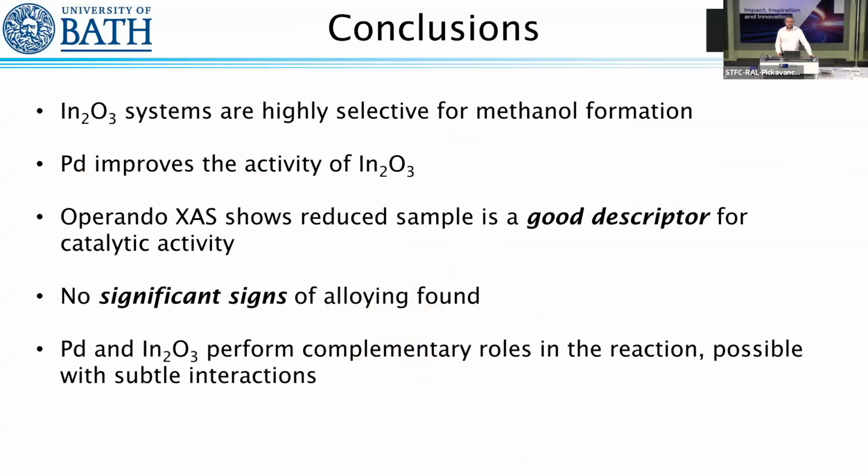And this was our conclusion from the first half. Indium oxide's very selective for methanol formation. Palladium improved the activity. The operando X-ray shows that the reduced number is a very good descriptor for catalytic activity. We saw absolutely no signs of alloying, despite desperately looking for them, and that the palladium and indium provided very complementary roles in the reaction, and this is possibly due to subtle interactions. So this is the end of the first case study.